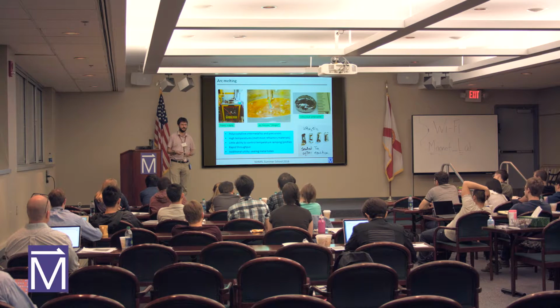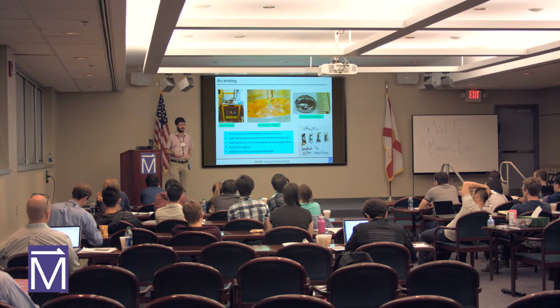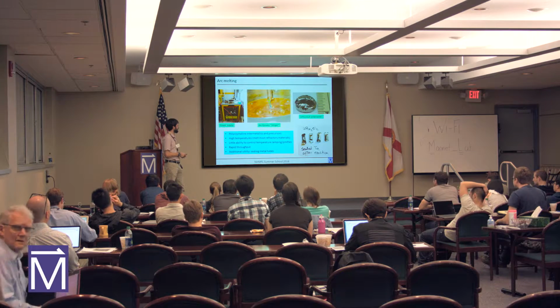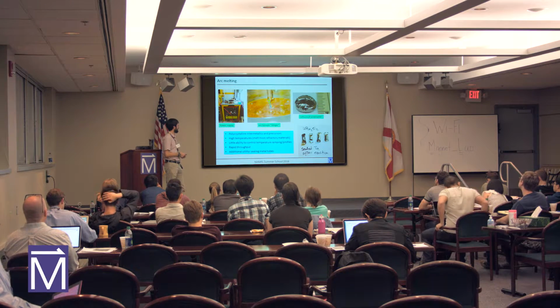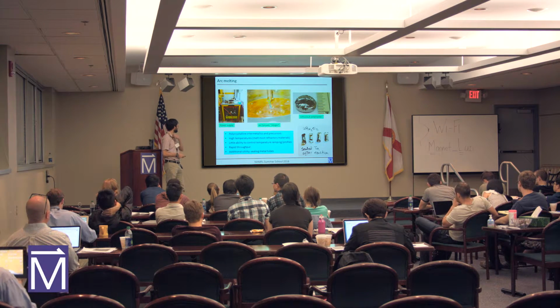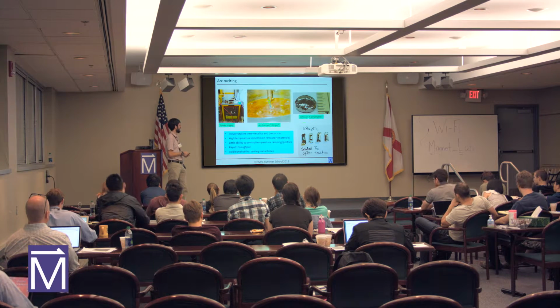So as an example, when you put carbon into things, usually the melting temperature goes very high. Or if you put boron into things, the melting temperature goes very high. But in this way, you can actually react things that include boron or carbon or other refractory metals like tantalum and niobium and so on. Okay, so here's an example of what will come out. Actually, this is a boron-containing material. So it's cerium, ruthenium-2, gallium-2, boron. Each of these elements actually have a pretty high melting temperature, except for gallium.